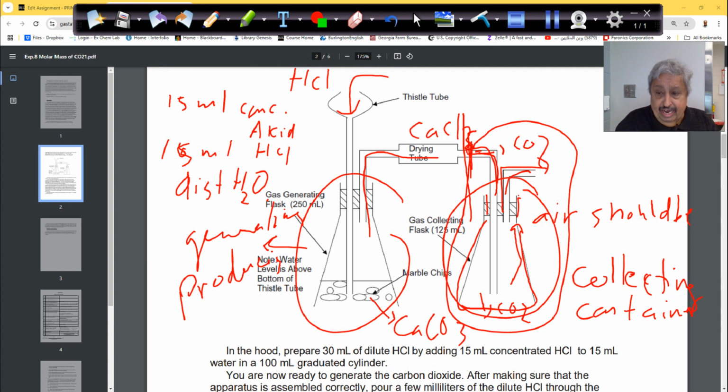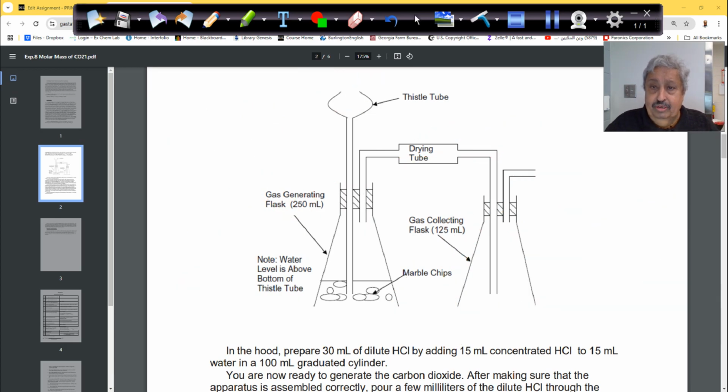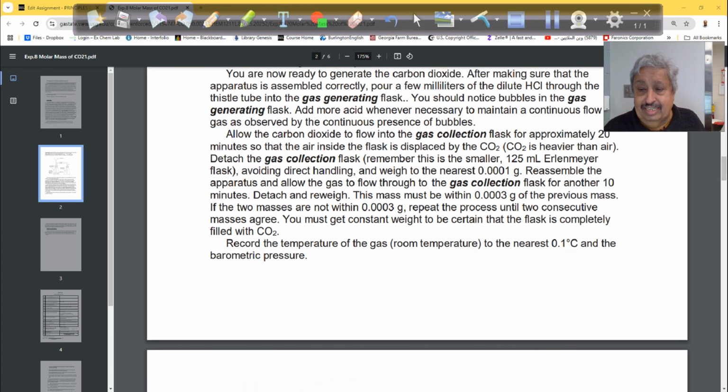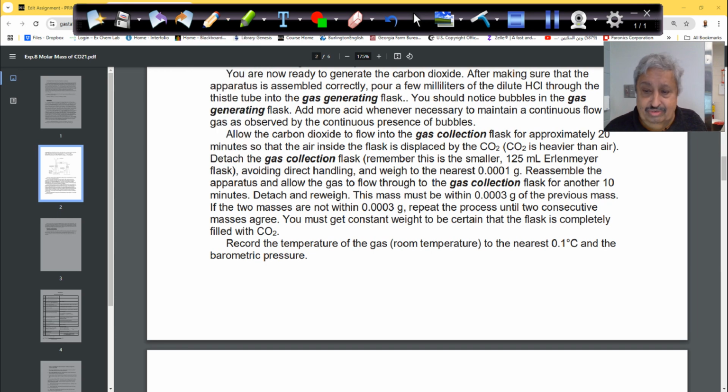You will do all this here, and then we'll come back to the value you are generating. Don't consider this value here, because it is very hard to utilize. I can tell you up front, so don't waste your time. You'll be here until maybe the second day.